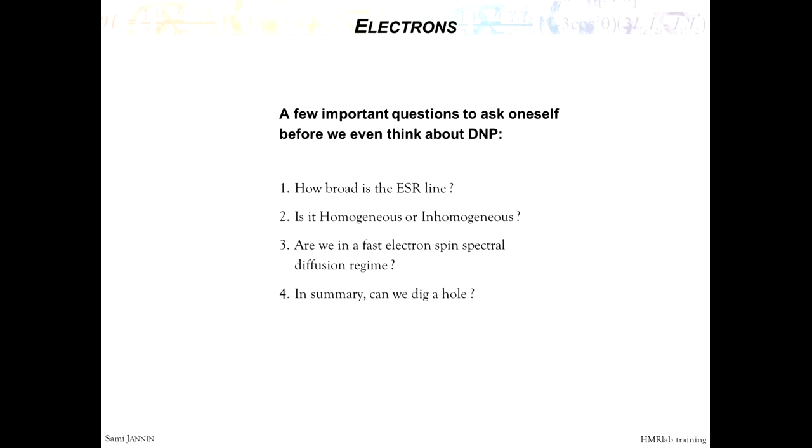We used to see that at 3 Tesla because we have a 400 milliwatt source. But now at 7 Tesla, we only have 80 milliwatt. We don't have enough power to see the decrease in polarization due to heating. But we see the heating. We can measure it in the helium bath, and this has an effect on the DNP for sure. What we don't know is the temperature of the sample.